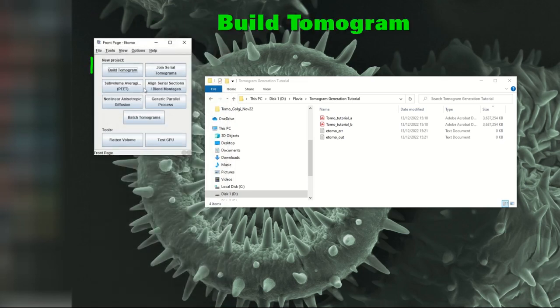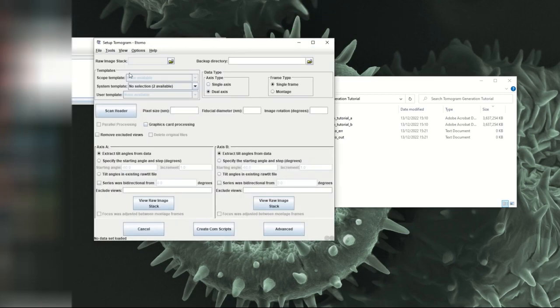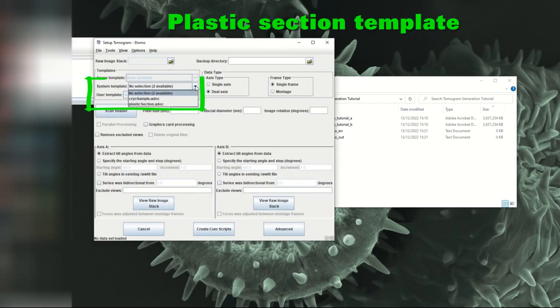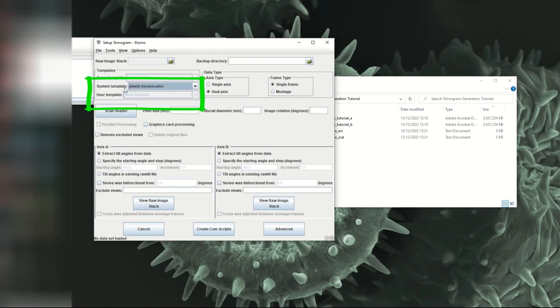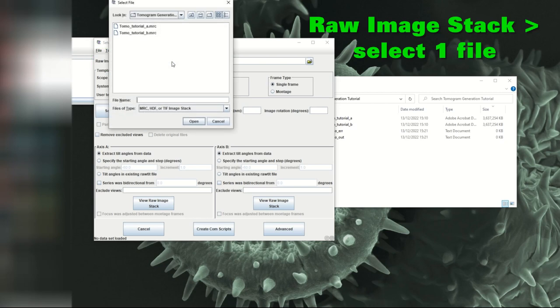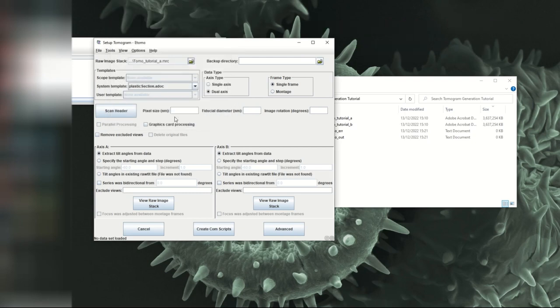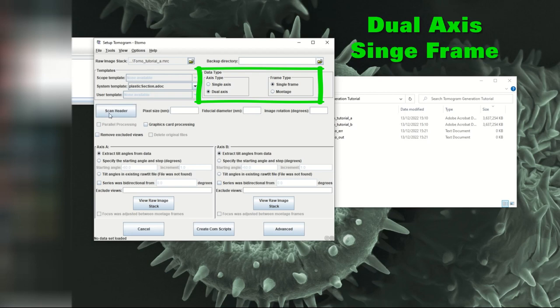So now I'm going to close and click on build tomogram. I will select the plastic section template because these are plastic sections. Click on the raw data, select one of the two files and then click open. It should be set to dual axis single frame. That's the type of data we've got here.